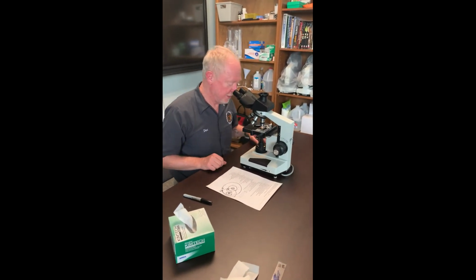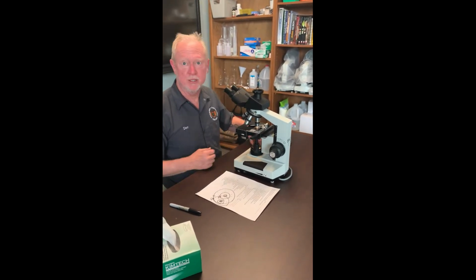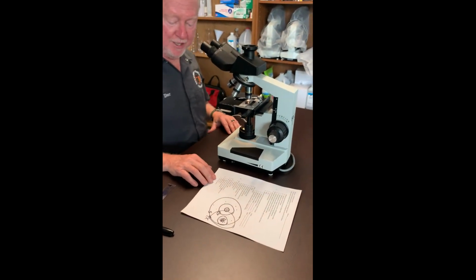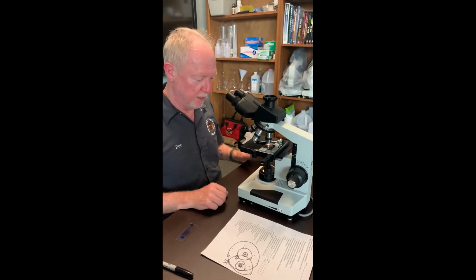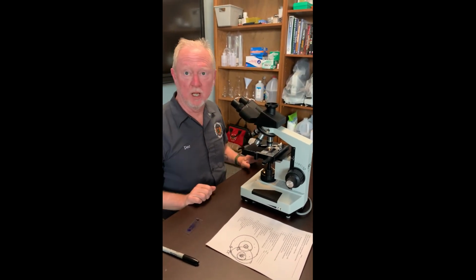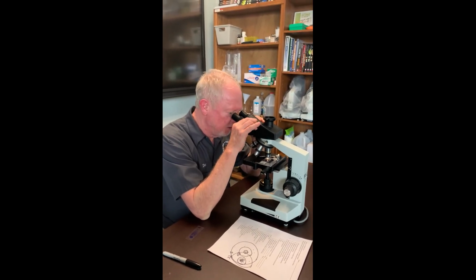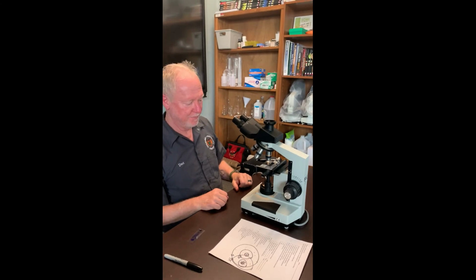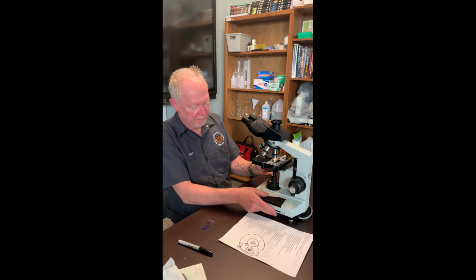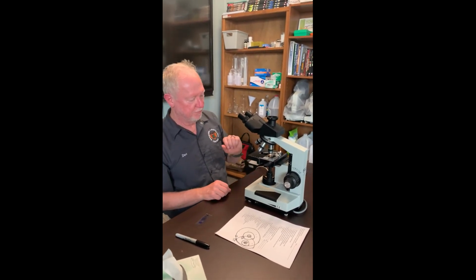Can't see nothing. All right. There are several reasons why you may not be able to see something, and when we're in Tennessee, we say we can't see nothing. So if I can't see nothing, let's troubleshoot a little bit. One, is my objective locked into place? Are my oculars the right width for my eye? Is my light where it needs to be? Adjust the light. I can't get it into focus.